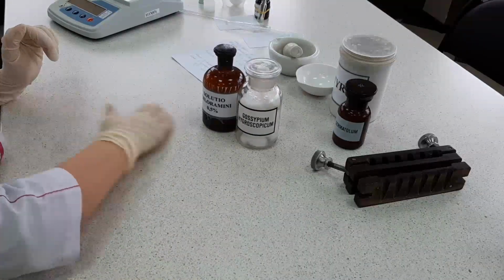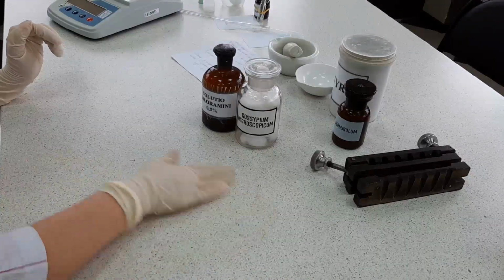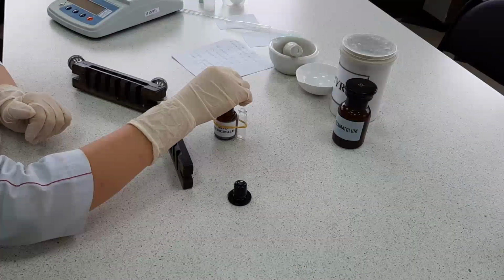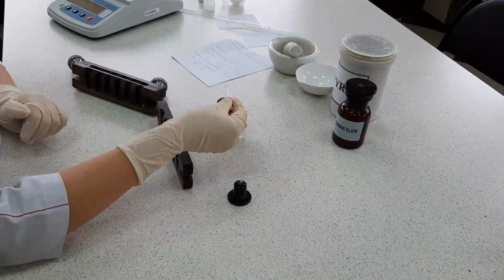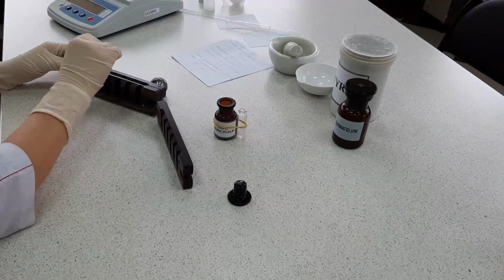Suppositories are prepared in aseptic conditions. Firstly, the pharmacist wipes the table with a solution of chloramine B. Since butyrol is a hydrophobic suppository base, the cells of the suppository mold are lubricated with soapy alcohol.